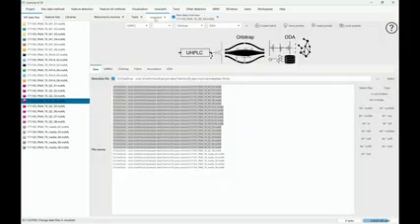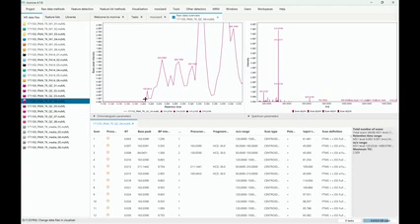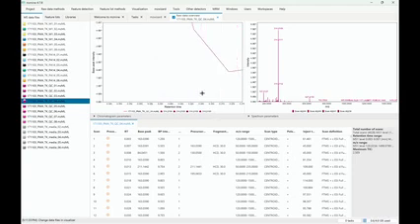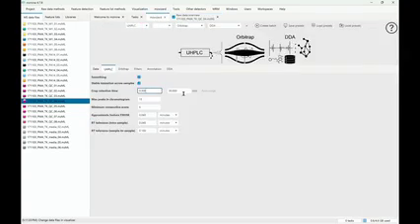So we can switch over to the wizard, go to UHPLC. It's important you keep the wizard open in one of the tabs, UHPLC, and in here we could, for example, cut out the first 0.3 minutes. If we look here, it's a bit more than here. There's a little gap then, and we're just going to cut out the 0.3 minutes at the start.